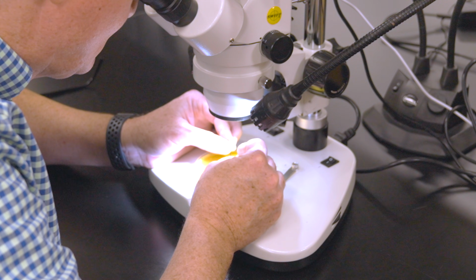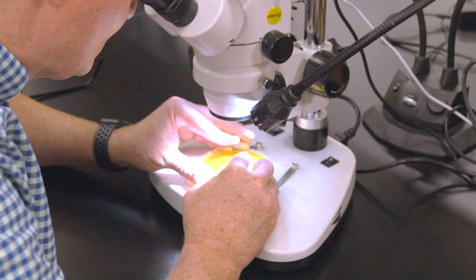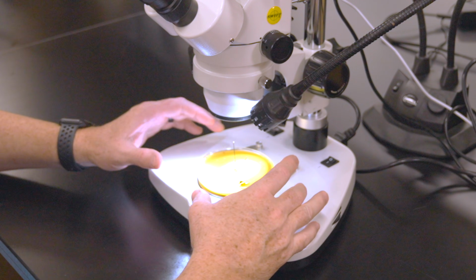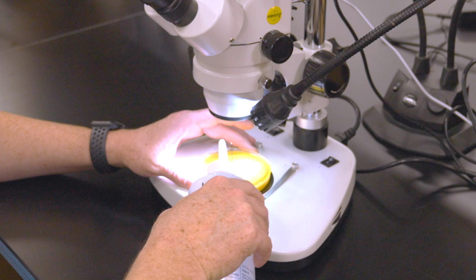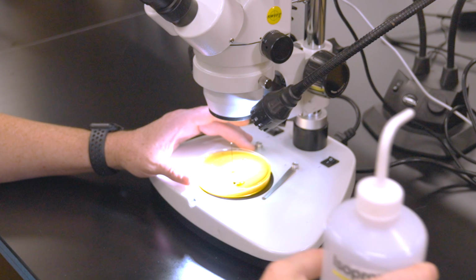Once that thorax is on its back, in other words, on its wings, I will take 2 insect pins and insert them from both sides of the thorax. Some people will pin the bee first and remove the head and the abdomen.